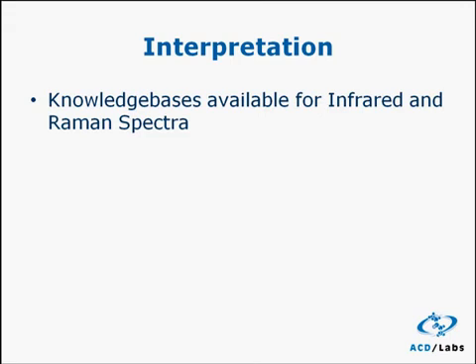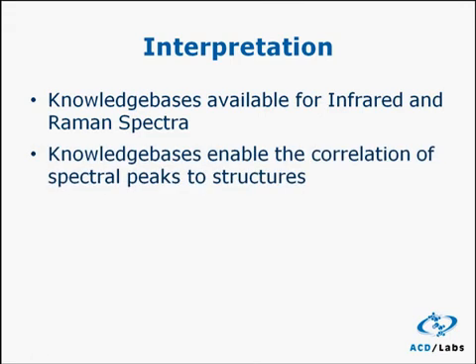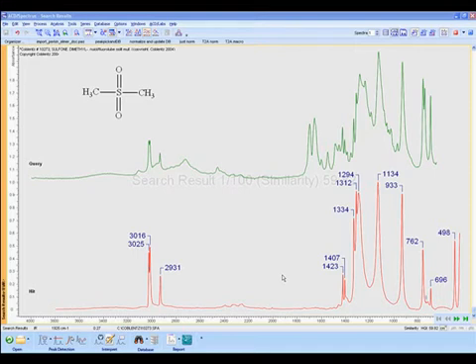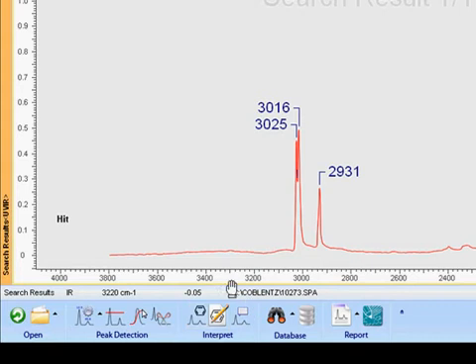These will enable us to make correlations between structure and spectral peaks. Working with the same unknown and database search result we generated earlier, we'll start by going to the interpret buttons on the workflow bar.